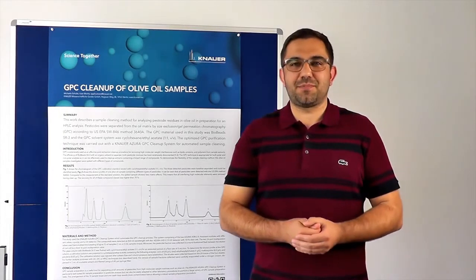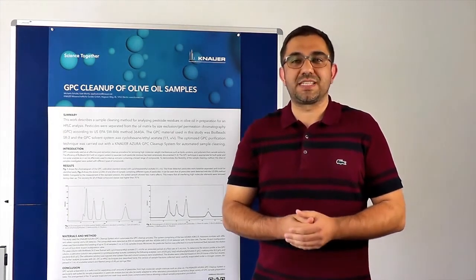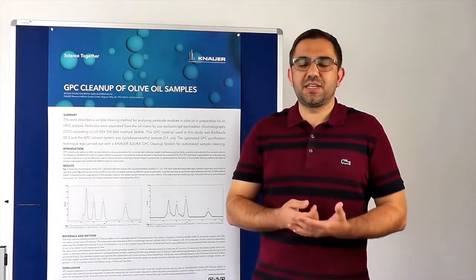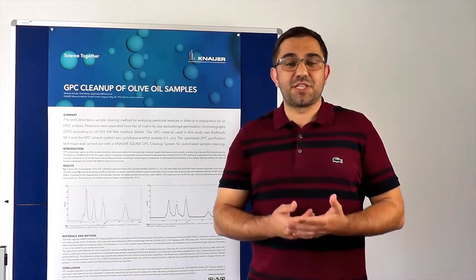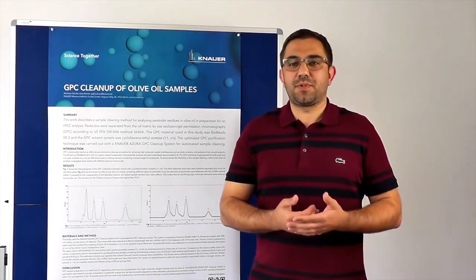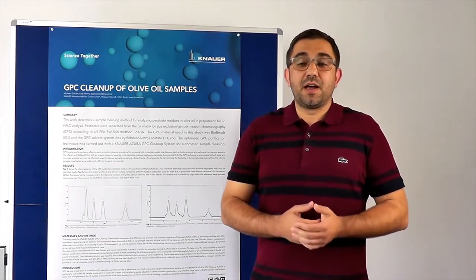My name is Hagen Schlicke from the application lab here at the Knauer headquarters, and today I want to talk about GPC cleanup. So GPC is used for an effective post-extraction cleanup procedure to remove, for example, high molecular weight residues in your sample before HPLC analysis.